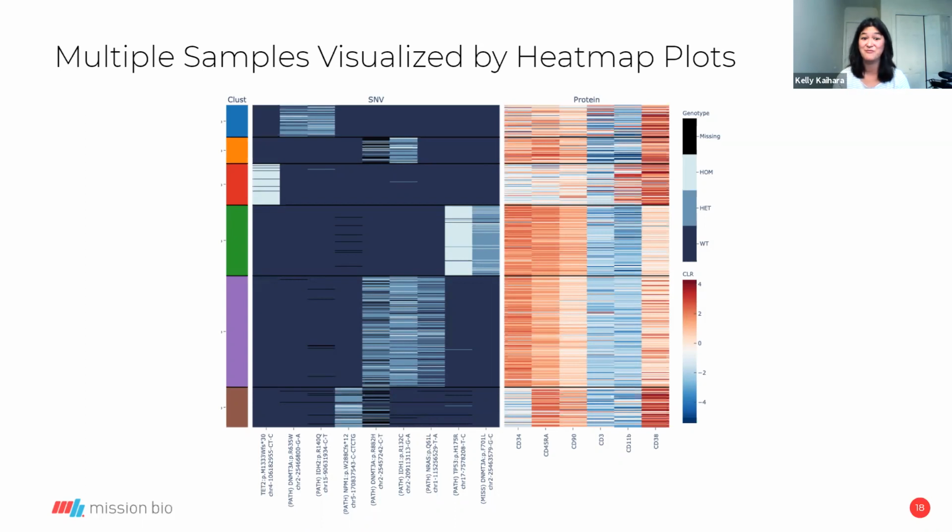And he also shows the same phenomenon where he has a patient that has the NPM1 mutation and in general has lower CD34 expression. But what was really exciting about his data set was he actually found a subpopulation that was CD34 positive, which was unexpected, that still contained the NPM1 mutation. So I think right now we're kind of looking at these bluntly larger effects, but you can also, again, cluster within the CD34 population to find even more refined subpopulations overall.